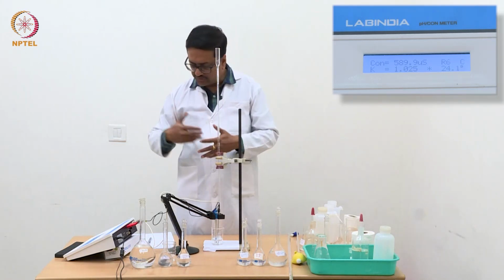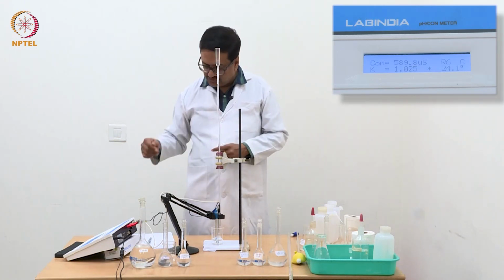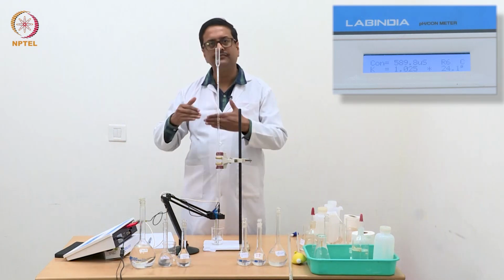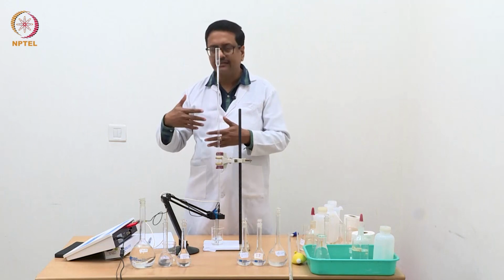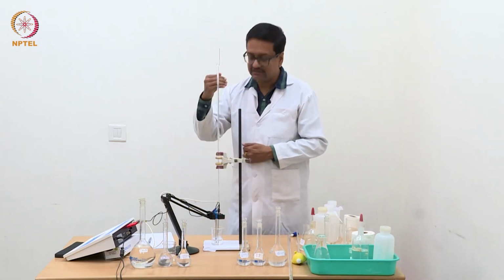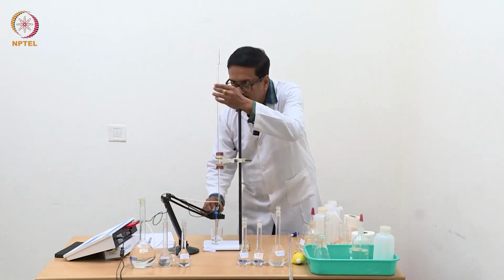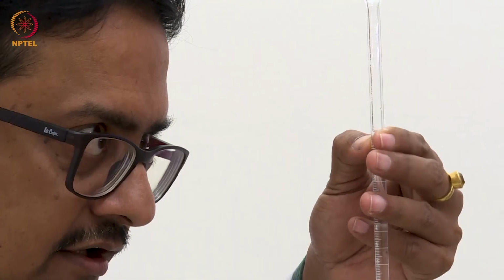So about 30 to 40 microsiemens difference is coming even now with 630 becoming 590. So that gap of conductance between the readings is maintained at about 40 microsiemens, which means that we are still constantly decreasing the conductance because we still have HCl in solution.